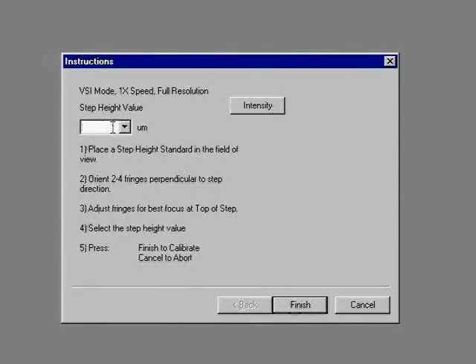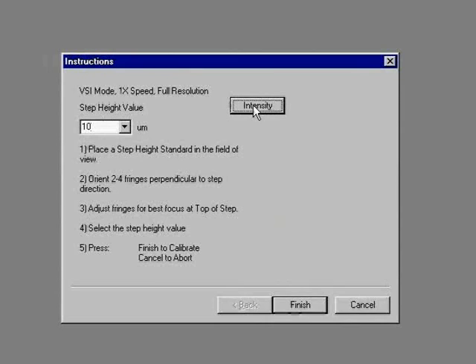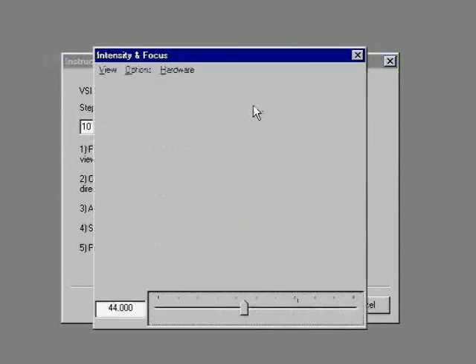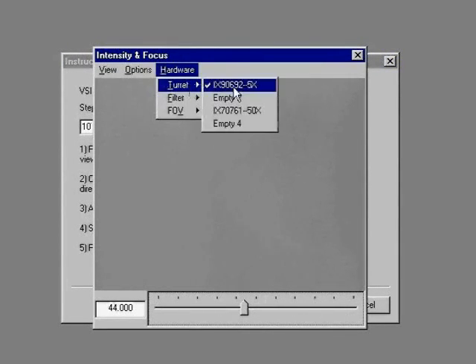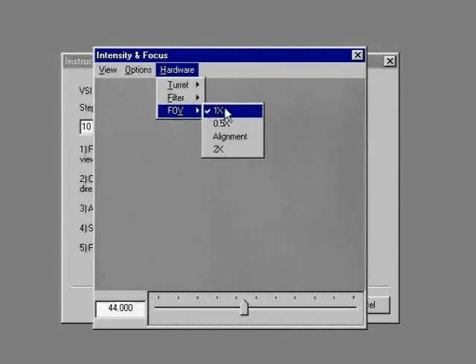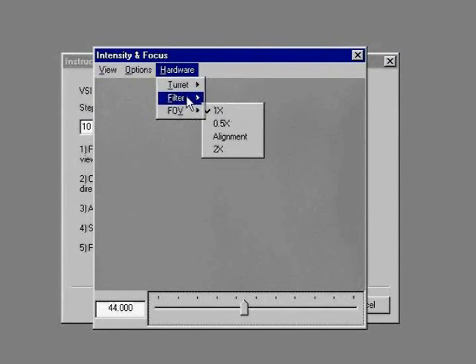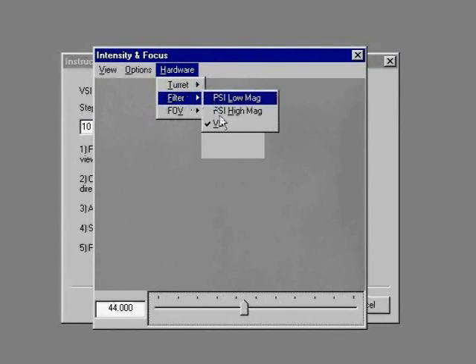The step height value is printed on the calibration standard and is 10 microns. To focus on the standard and observe the fringes, we open the intensity window. Go to hardware. Make sure the 5x objective lens is selected and the 1x field of view. Also check to see that the filter is set to VSI.